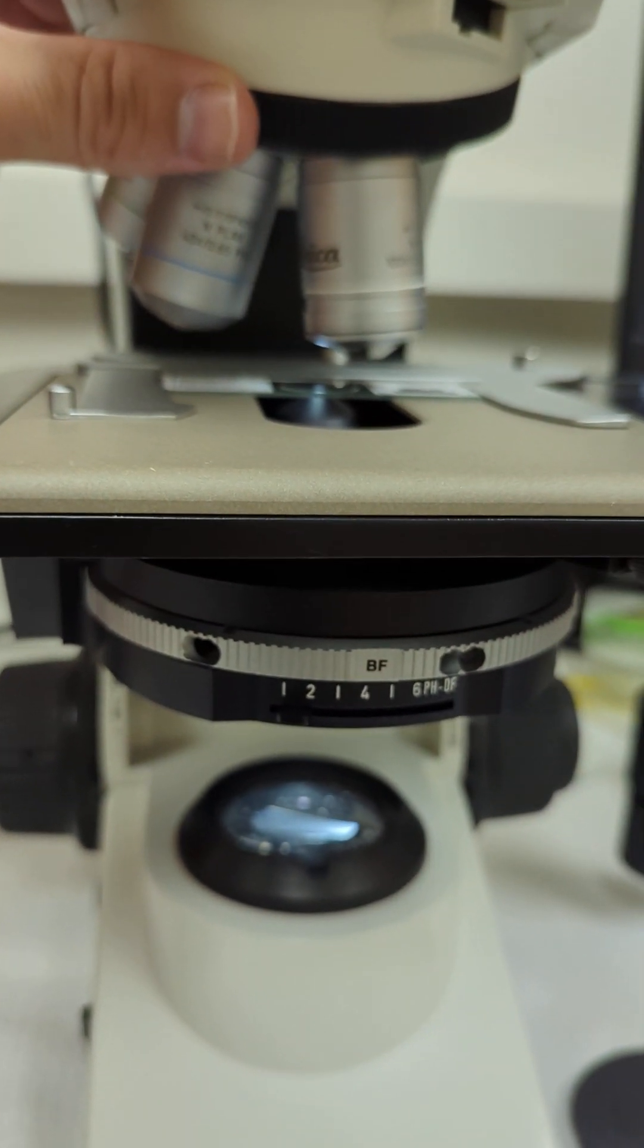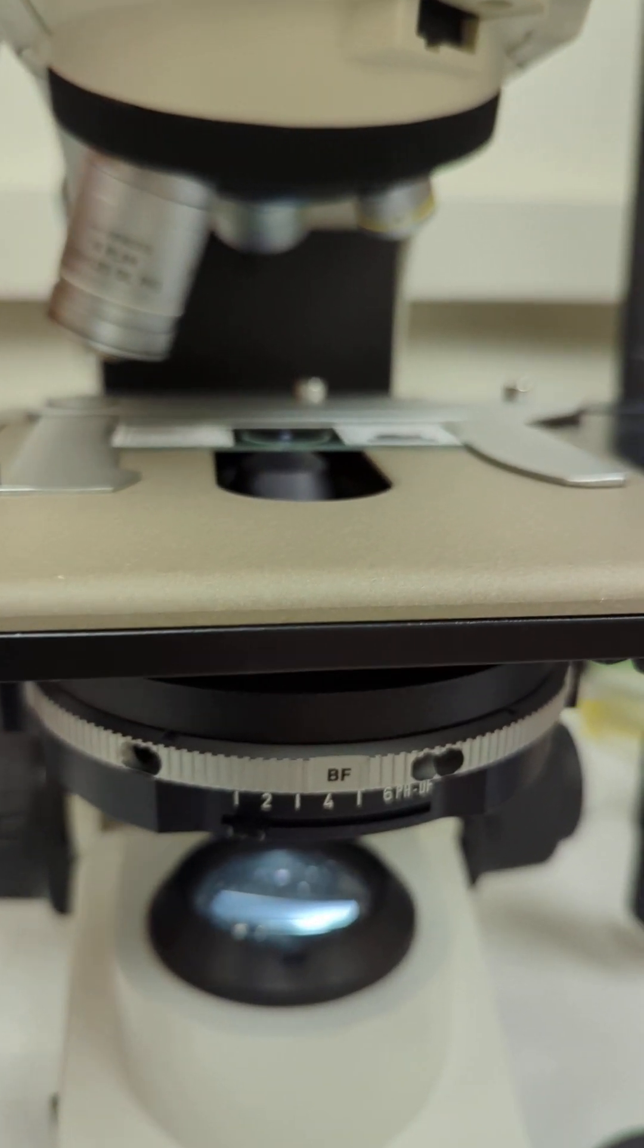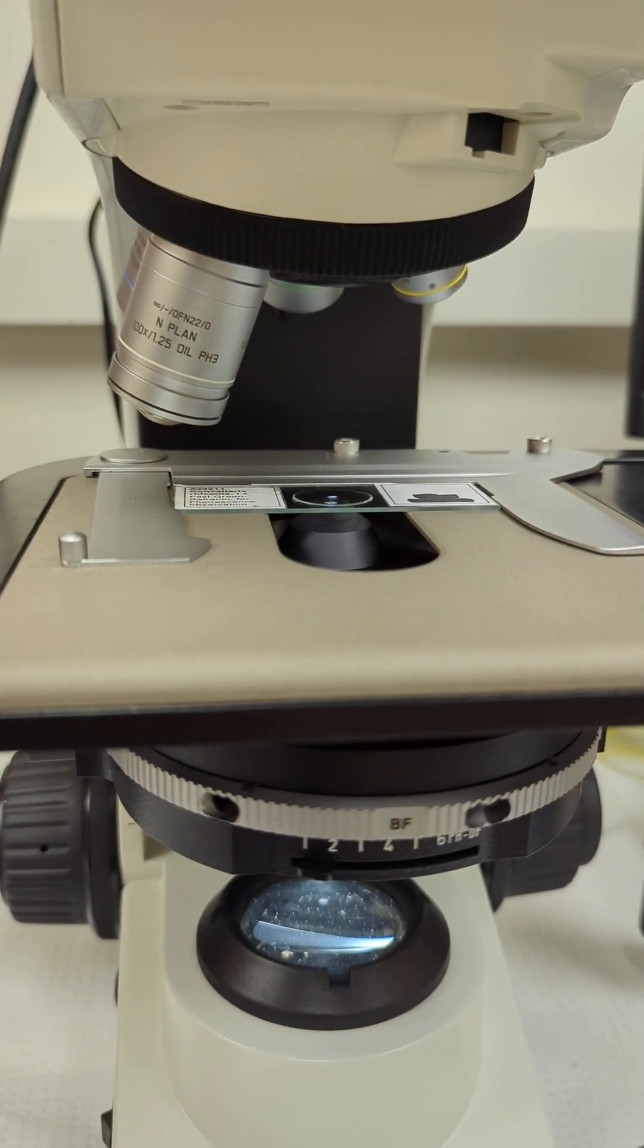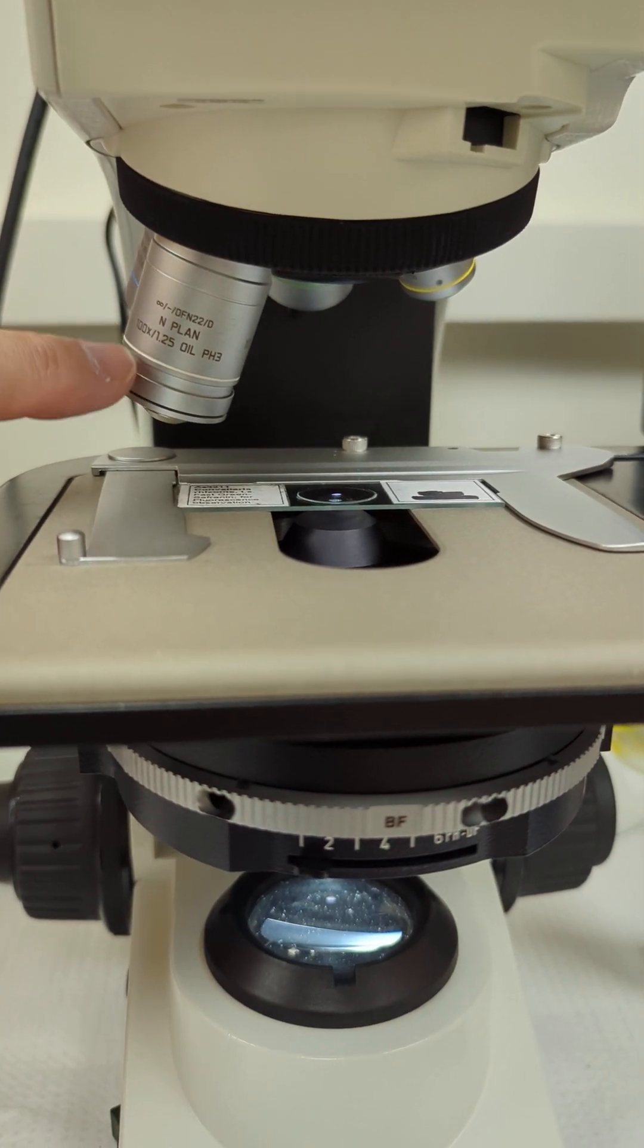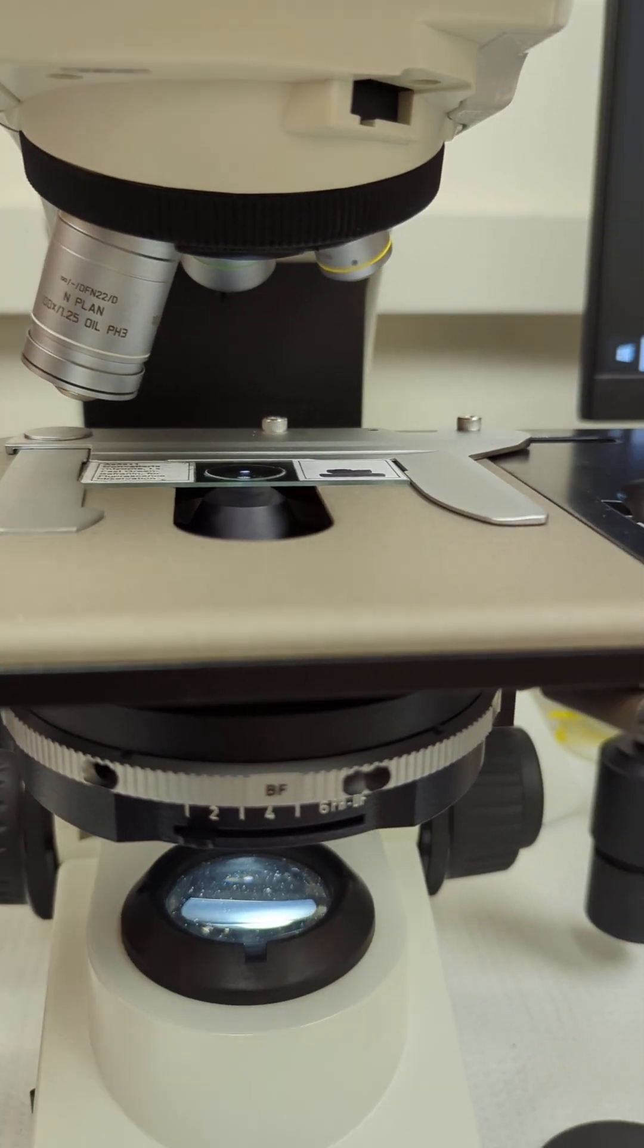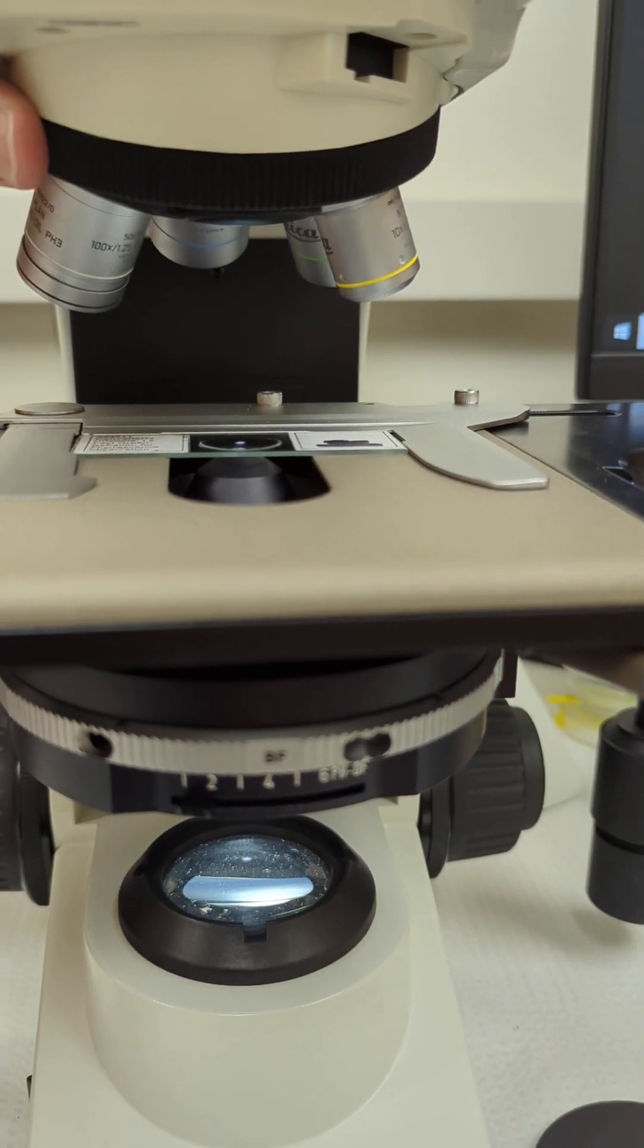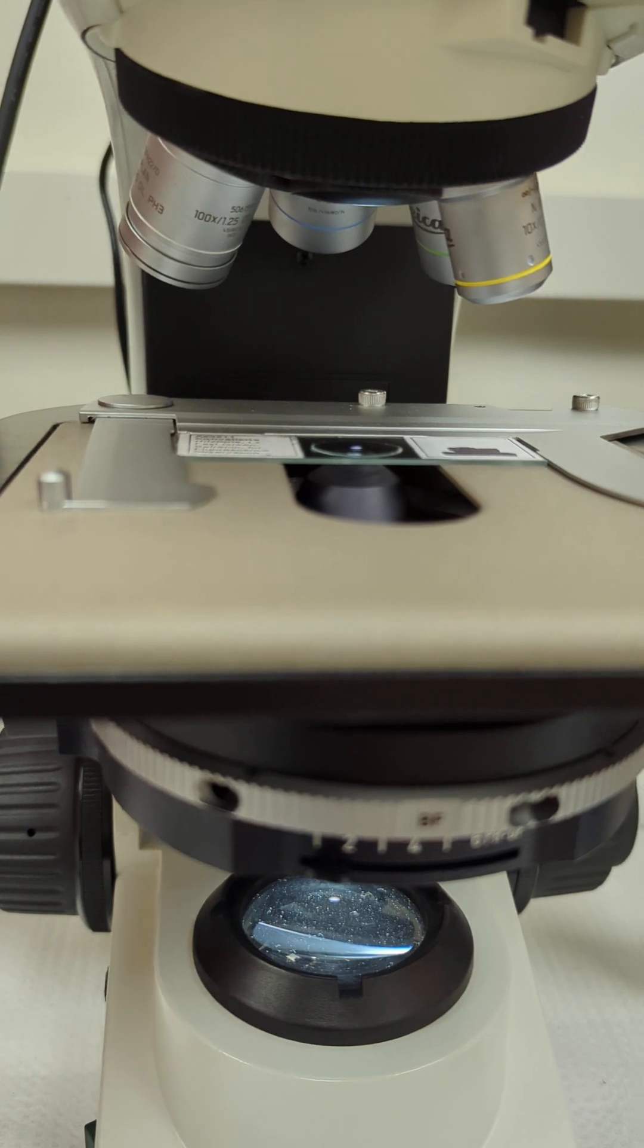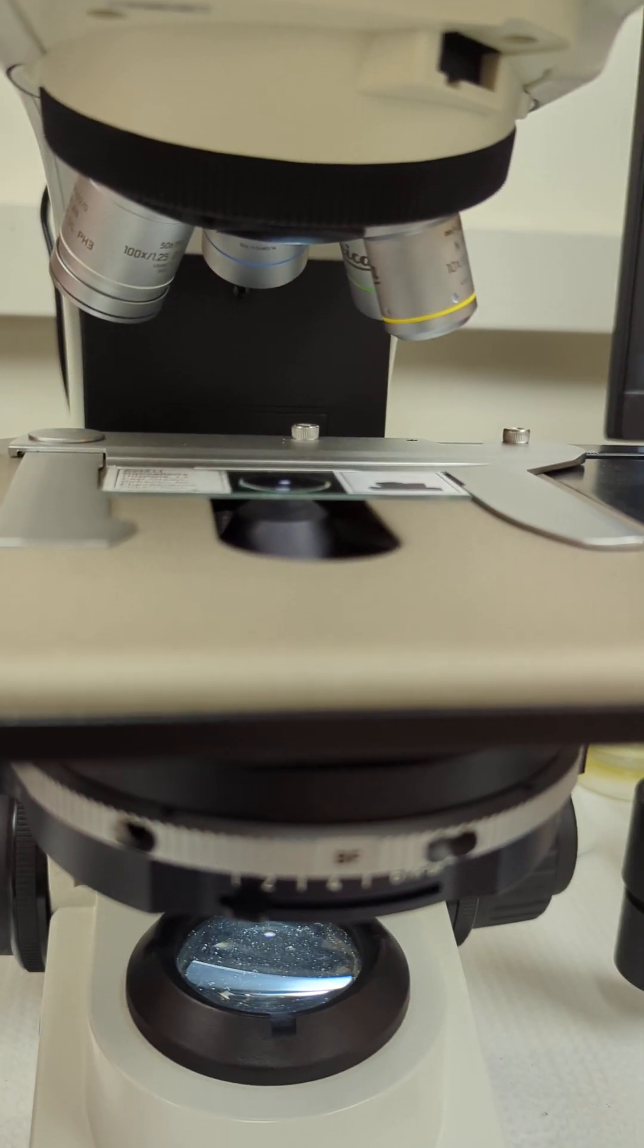Every time you use oil, go this way afterwards. Once you're done with the oil, swing it that way. It's out of the path, nothing can get smudged. You can even go one more.